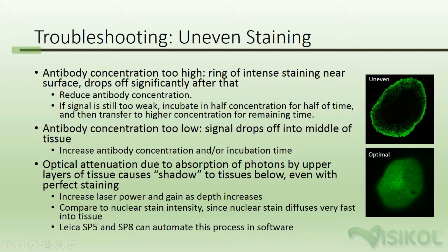Uneven staining can also be due to optical attenuation. Absorption of photons at the upper layers causes shadowing for tissues below, even with perfectly even staining. The way to get around this is to increase the laser power and gain as depth increases. You want to compare your immunolabeling to your nuclear stain intensity, since nuclear stains diffuse very fast into tissue. The Leica SP5 and SP8 can automate the process of compensation as depth increases.